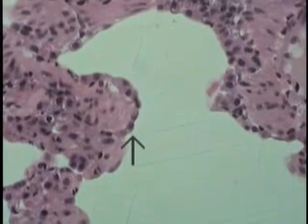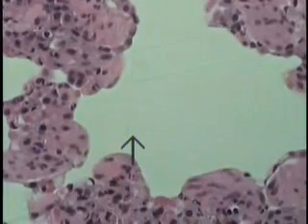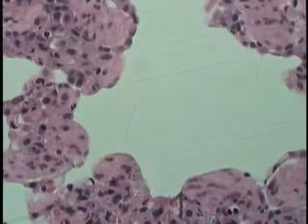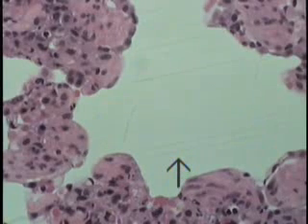An additional segment through another respiratory bronchiole, showing you the spiraling nature of the bronchial smooth muscle as it opens up. This is the typical cuboidal lining covering epithelium, and then if we trace it down slightly, you can see how they're ballooning out. The epithelium becomes much, much thinner in these little outpouchings and the initial appearance of the alveoli.